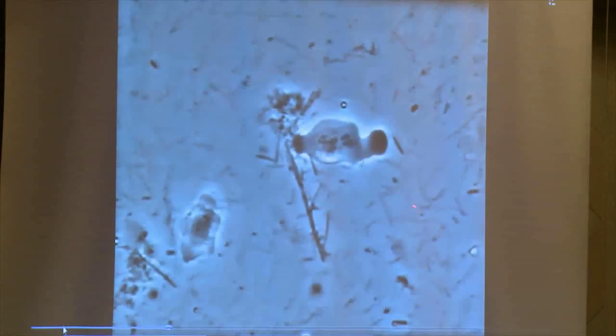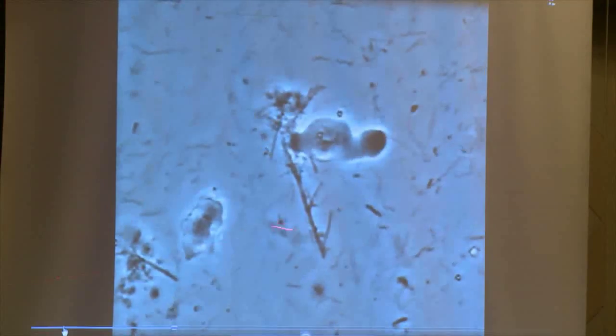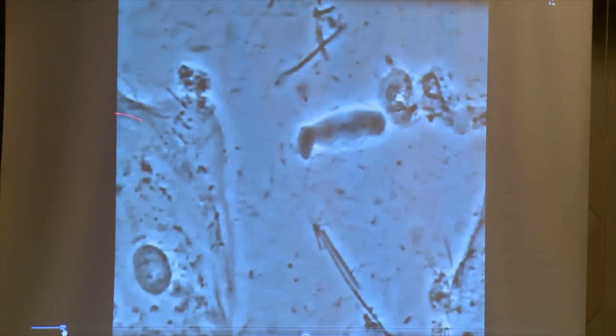Spinning rods, gliding rods. There's a gliding rod coming through there. These are the spinning rods. This is another amoeba over here on the edge here that it's quite dormant sometimes, but you just look to make sure that you get one that's actually moving. Amoebas, this is a skin cell here, large irregular shape with the nuclei in the middle. Actinomyces and more. Did that stop? Sorry, I paused it somehow.